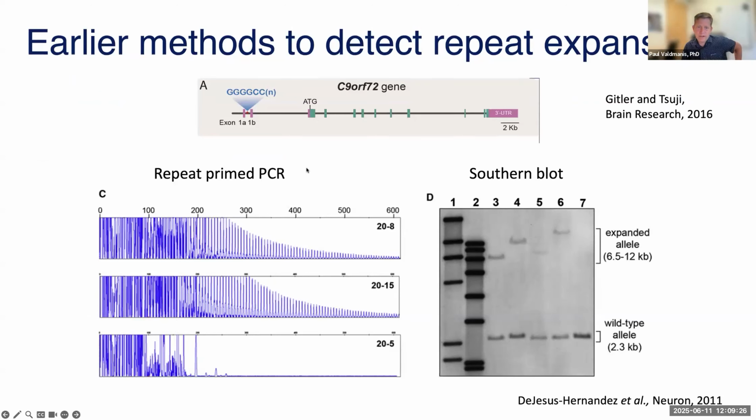And really, for a long time, there wasn't a very good system for identifying exactly this internal sequence. This is an example of the hexanucleotide repeat in C9orf72, which was identified primarily through classical approaches like Southern blots, where radio-labeled probes can, after digestion of DNA, reveal some of these larger repeat expansions in individuals with ALS. And these repeat expansions could be confirmed with PCR with labeled probes that can indicate a hairpin-like, stepwise kind of process that indicates that these individuals have larger repeats, but it doesn't tell you exactly the internal sequence of the repeat or exactly how many copies there are.